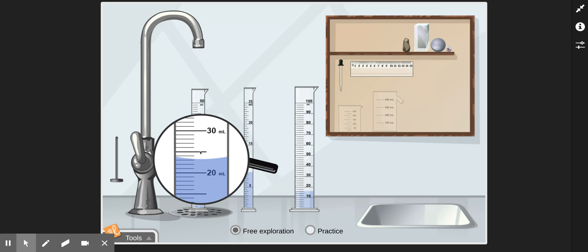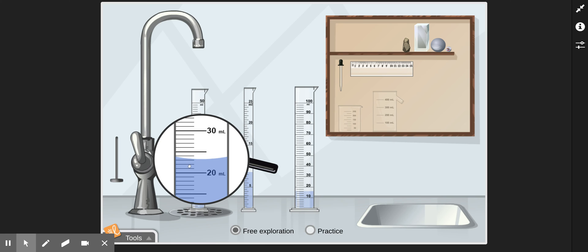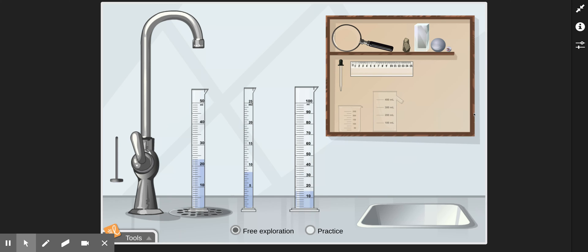And then finally, the third, we have 10 milliliters of change between 30 and 20. And there's also 10 spaces if you count them out. 10 divided by 10 is 1. So each line represents 1 milliliter. And if we double check that, 20, 21, 22, 23, 24, 25, 26, 27, 28, 29, 30. That checks out as well for 1 milliliter for each line. So we start with 20, 21, 22, 23 milliliters in this third one. So that's how we read a graduated cylinder.